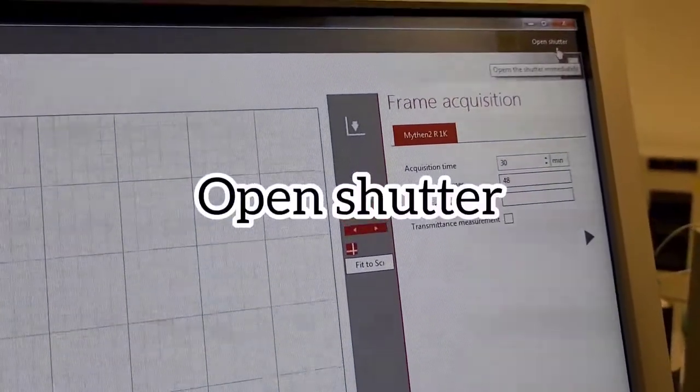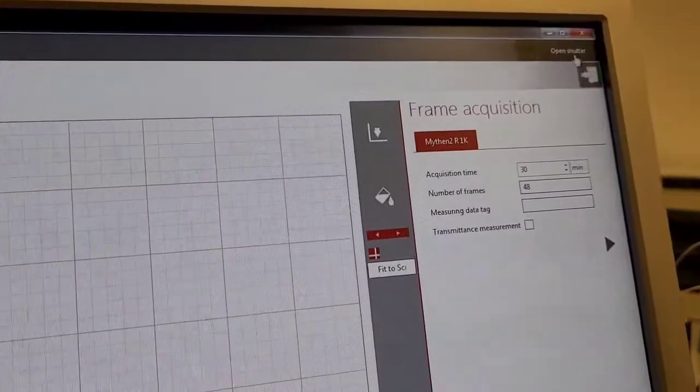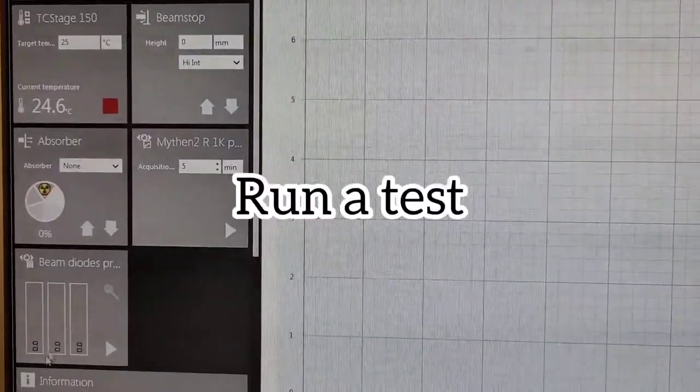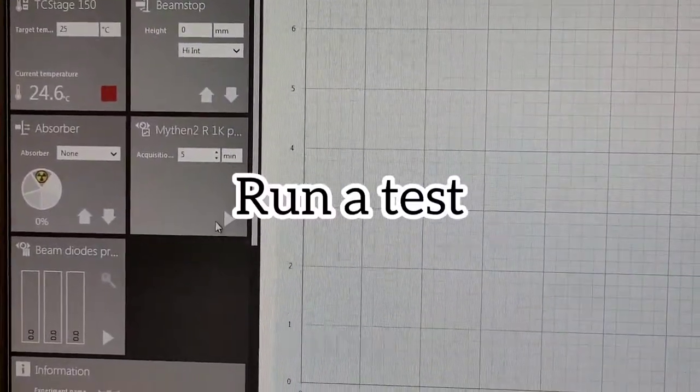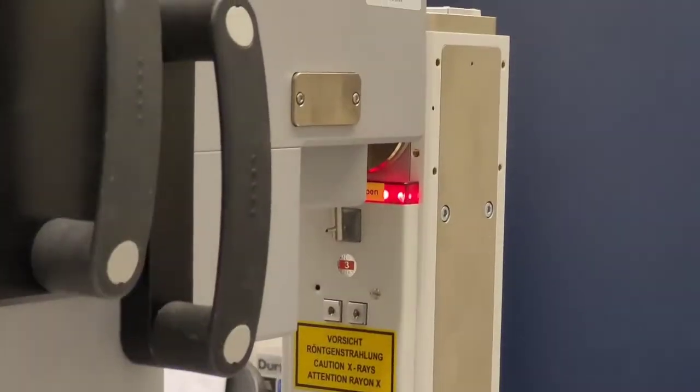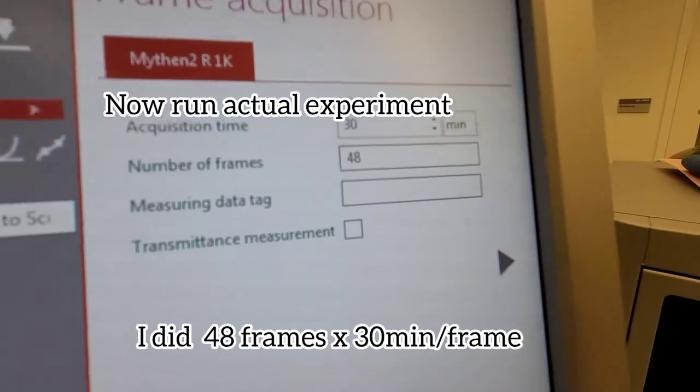Then I'm going to control the temperature. Now open the shutter so the x-ray will actually go through the box where my sample is in it. Once I do that I can finally do a test run. When you open the shutter you see a red light come on.